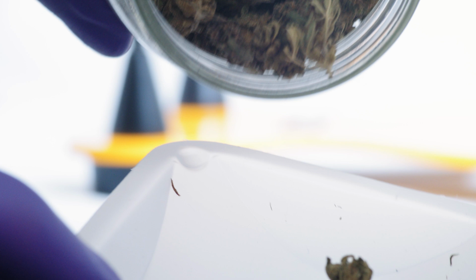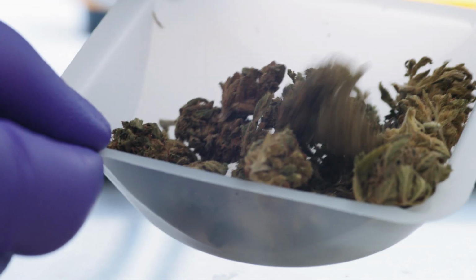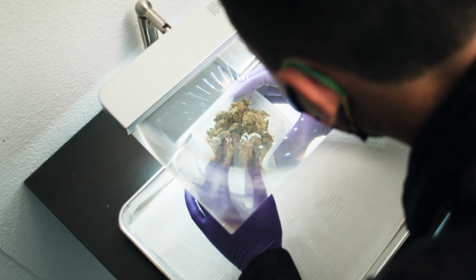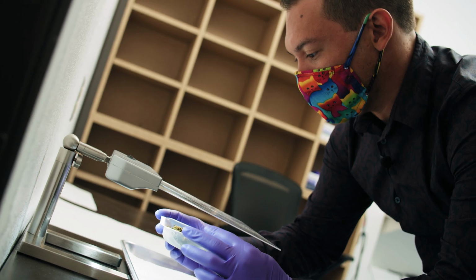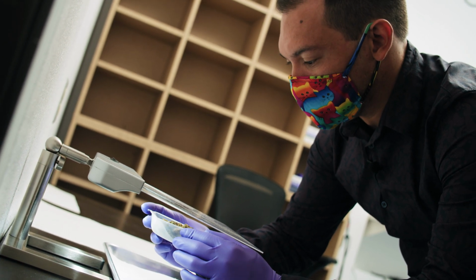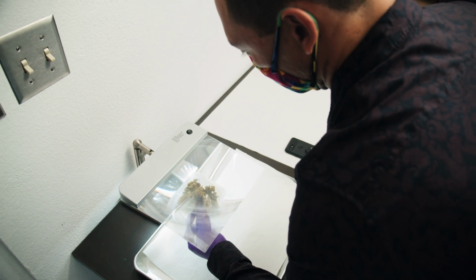After we photograph the sample, we're going to be looking a little more closely at it for filth and foreign materials. These filth and foreign materials could be anything from hair, rat feces, bug droppings, you name it, anything from the manufacturing process that could be left behind. We're going to want to look into that a little more closely and make sure that there's nothing visible on the sample.